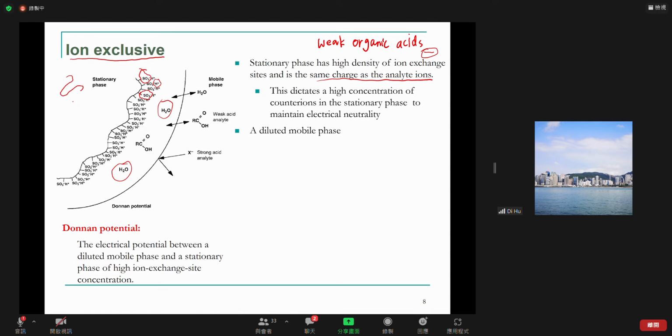So inside those stationary phase, they may be coated inside. So the water, because your mobile phase is just a diluted acid. Okay, so the mobile phase and the water actually get into the pores, and then they form what is called the occluded water layer. So it's actually the occluded water layer that now acts as something like a real stationary phase.